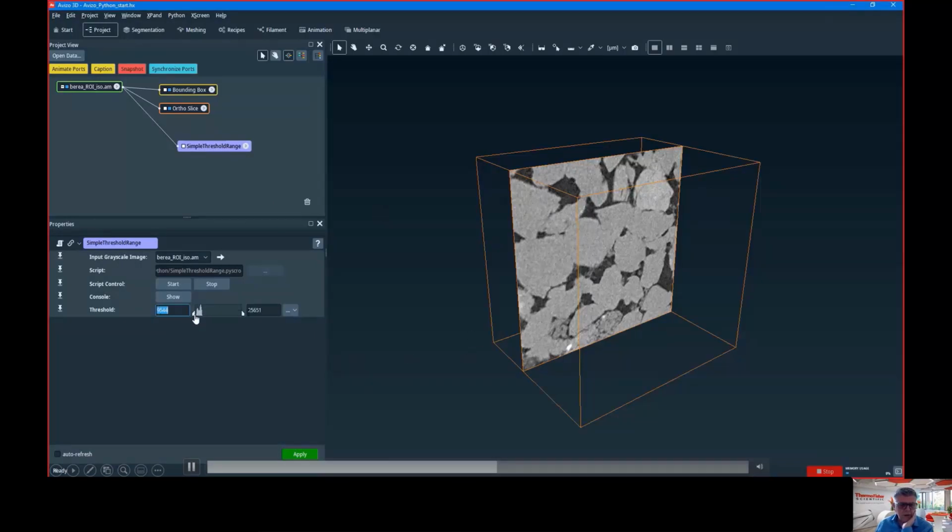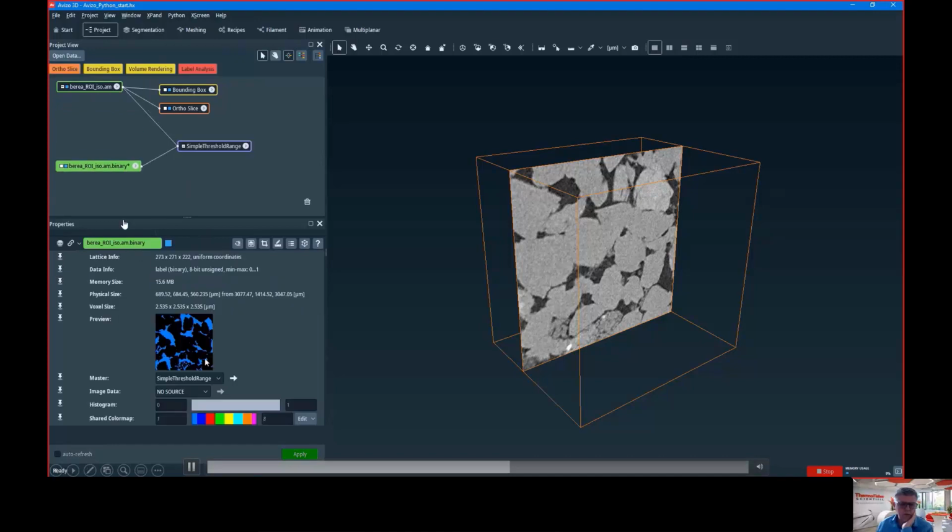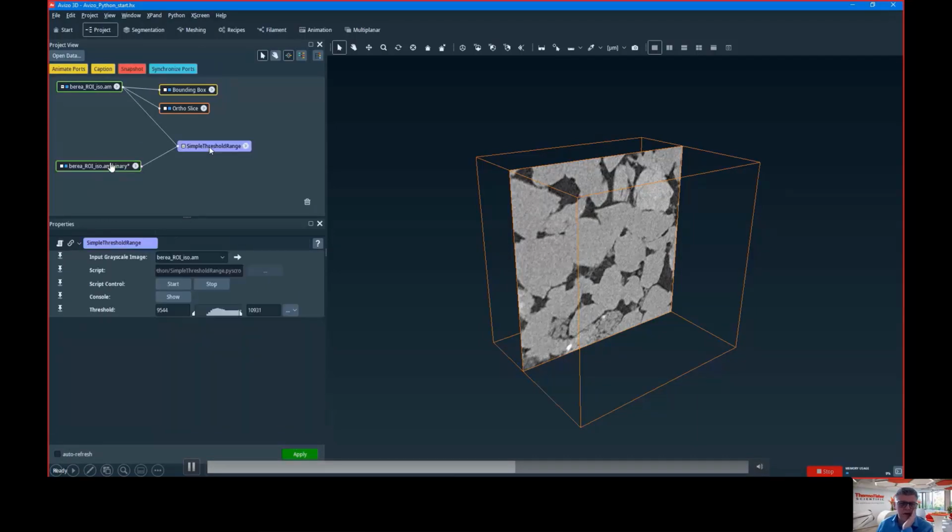So what happens if I move any of this, and then I do apply? Everything I move here is going to go through the update. If I hit apply, it's going to go through the compute. And the compute really creates an additional object with the code I showed you before. So it's going to create a label field, do the threshold things, store the output array, etc.